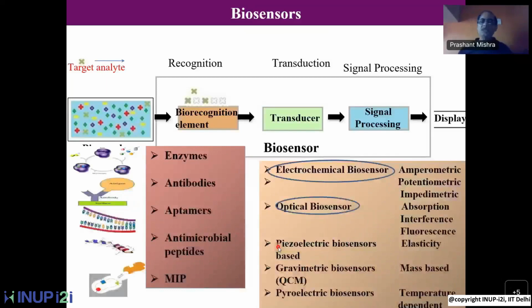Now I'm switching gears, and what you are going to learn about is sensors. Because so far you were learning, and many times it may come to your mind that, okay, this is the area where a chemist or a biochemist should be involved. Why should I learn about IR spectroscopy? And here, what you will learn is that FTIR has been used as a very powerful tool in developing chemosensors or biosensors. I'm taking one example. They can be extended to chemosensors as well.